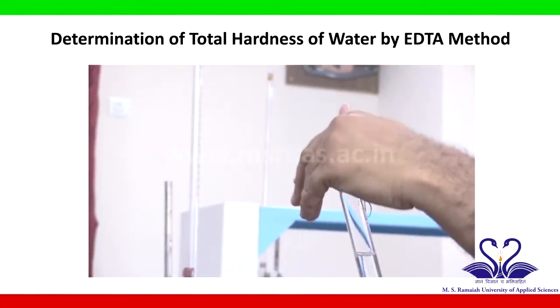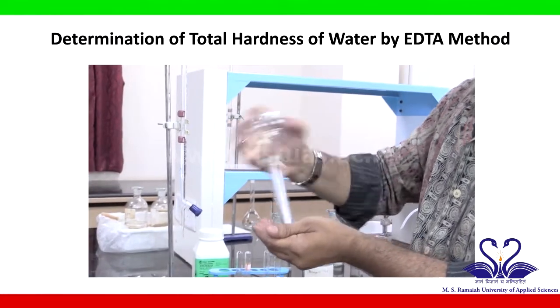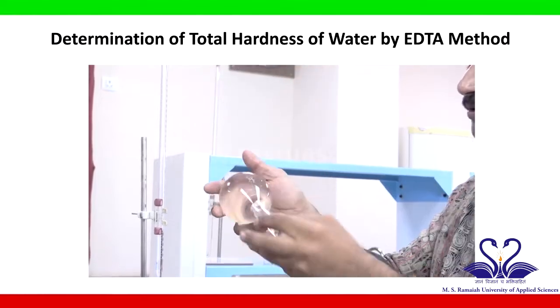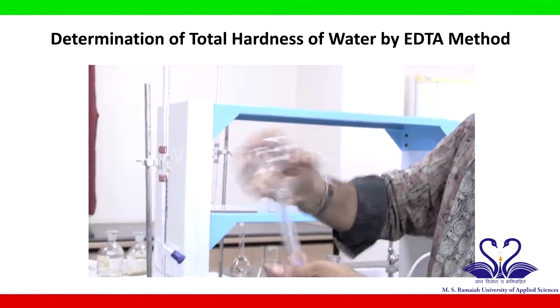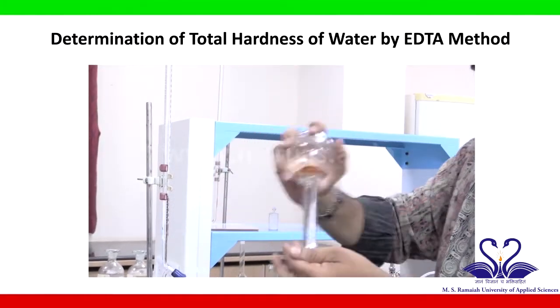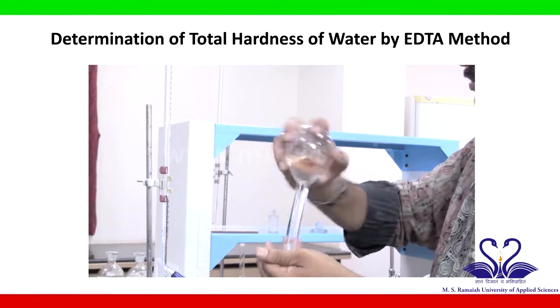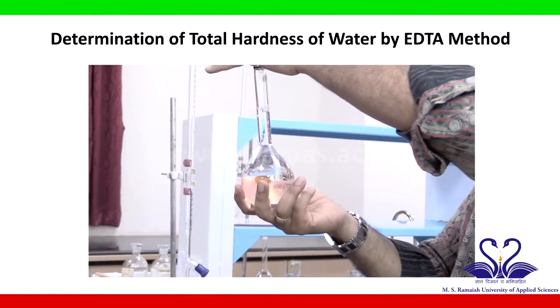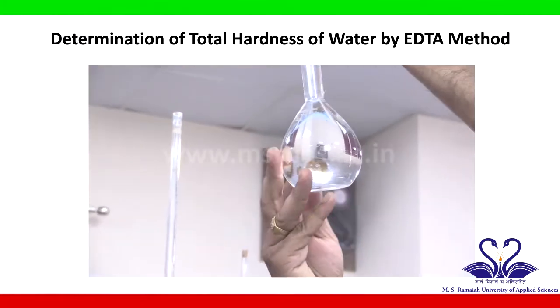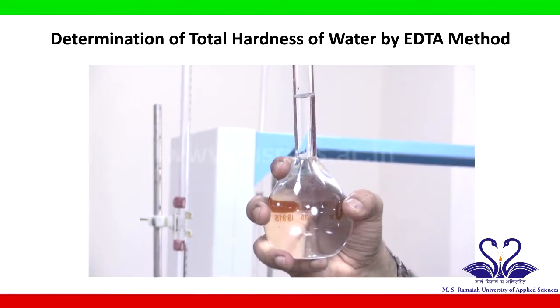Now you have to shake it thoroughly for uniform concentration. So shaking is important to make it uniform concentration there. So you have to make the air bubble come up, thoroughly shake it 3-4 times. You can see now it is cleared. There is no EDTA remaining. So your standard solution is ready.